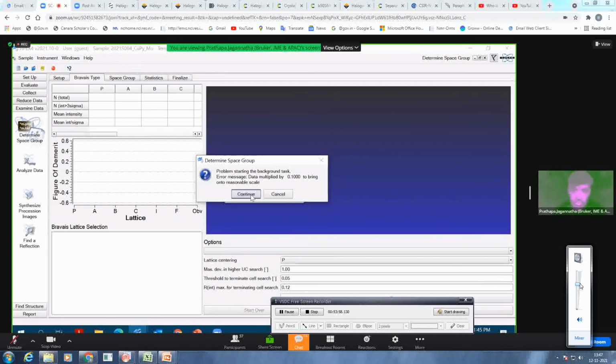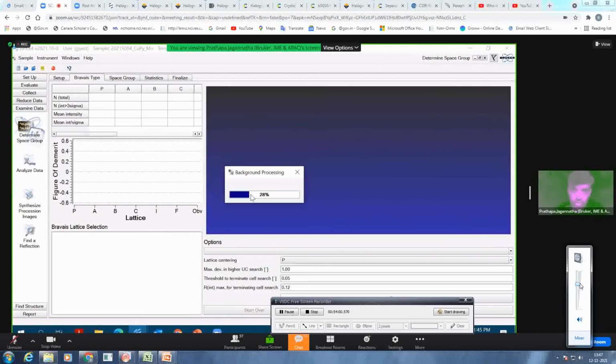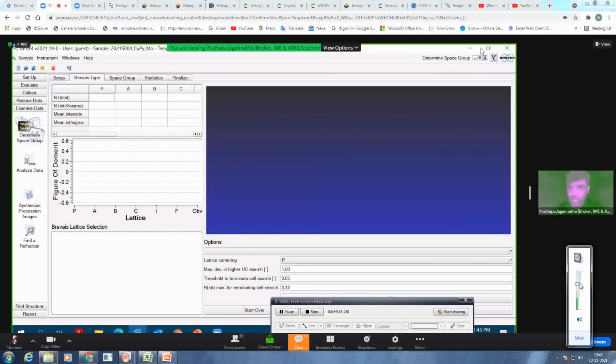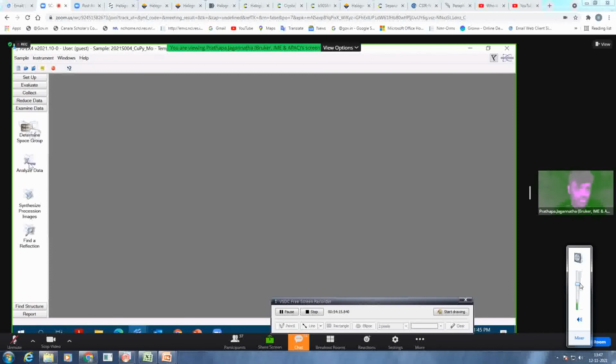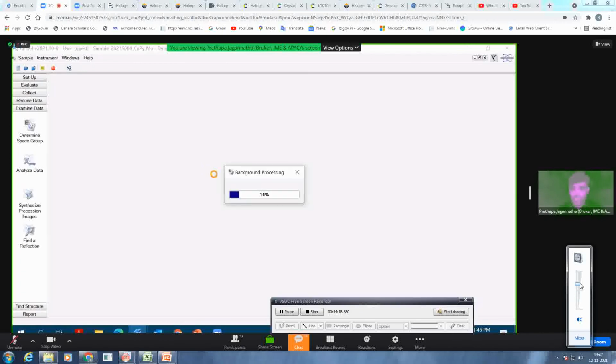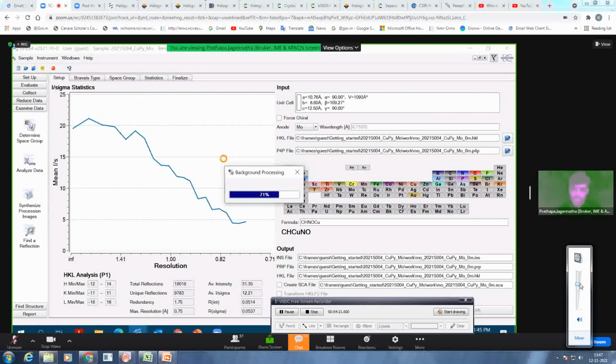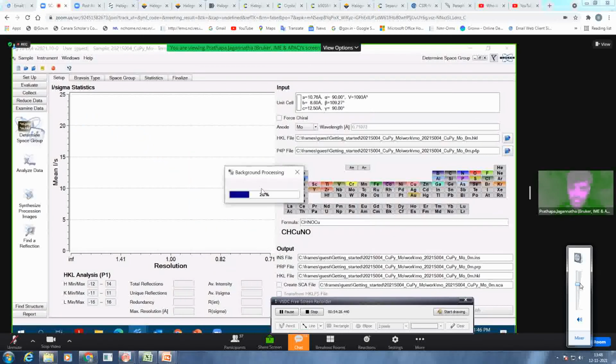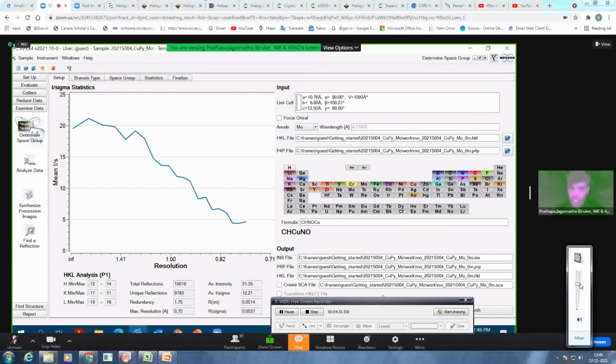Okay, what's that? Okay, something happened in my data. So let's have a look. Okay, so start again. Okay, I'm using the right file.